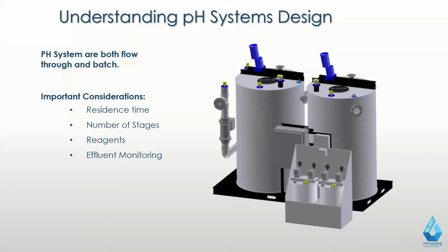And they're double contained. That's a requirement for OSHA. How much you can actually store depends a little bit on where your location is. And then you have some form of effluent monitoring in those cases, which is where you monitor for the city or your municipality how much waste you're putting down. In a lot of cases, that's a flow meter and your relative concentration of pH going down the drain.